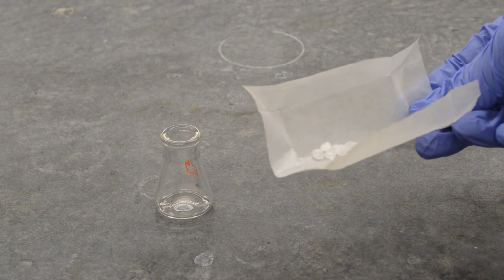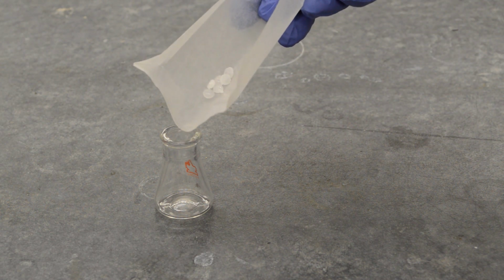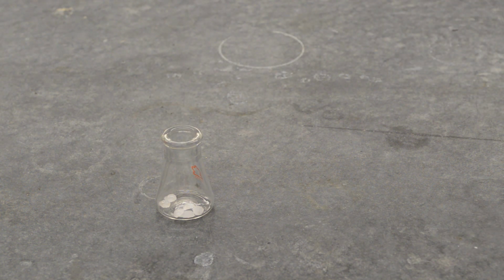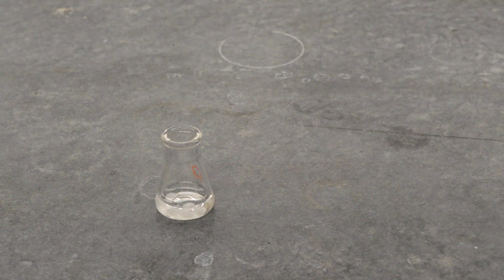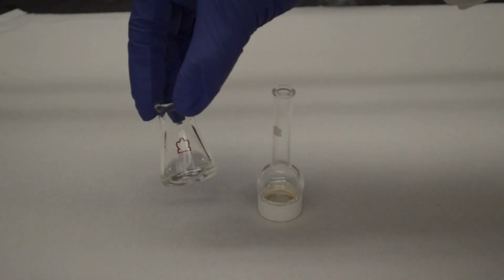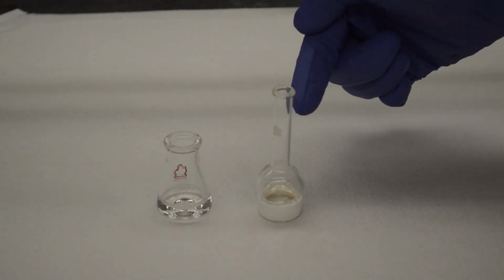Transfer the sodium hydroxide pellets into an Erlenmeyer flask, and add some DI water to dissolve it. Once the solid sodium hydroxide is dissolved in water, transfer the aqueous sodium hydroxide into a reaction flask.